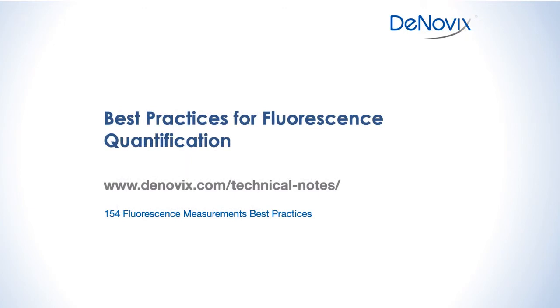So just moving on, the final section of this is really to talk about best practices. So if we've decided we want to use fluorescence, what are the best practices? What are the things we should consider and look out for when we're running samples or when we're setting up our lab to run fluorescence assays? So first of all, best practice, the hardware selection is important. We've seen earlier in the presentation the effect of hardware choices in terms of excitation and filters.